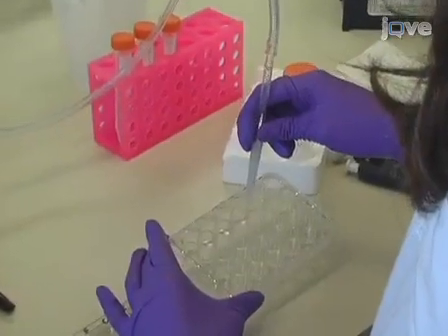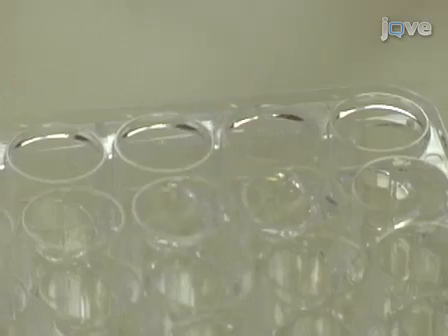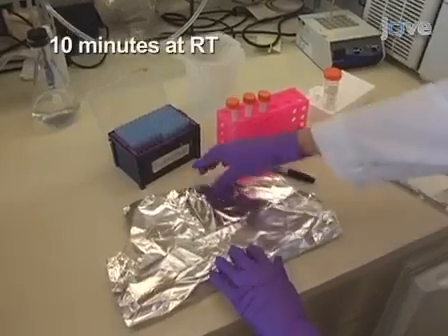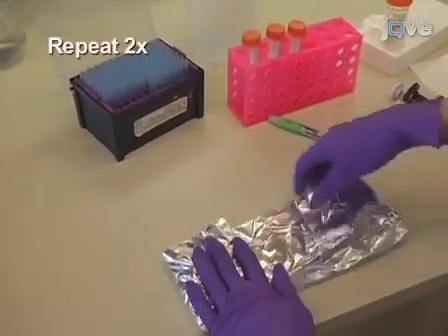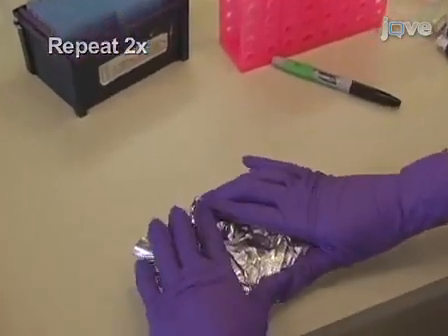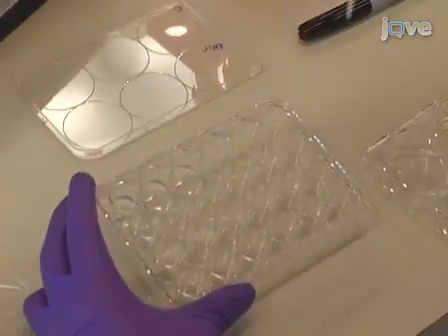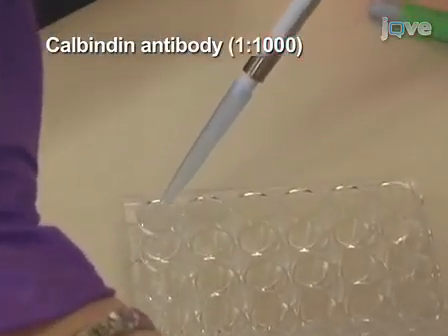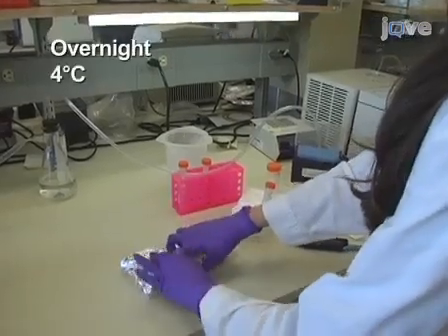When the hour has elapsed, aspirate the TUNEL reagent from the wells and replace with 500 microliters of PBS. Protect the plate from light and incubate at room temperature for 10 minutes to wash. Repeat this process twice. After the last wash, aspirate the PBS and add 250 microliters of a 1 to 1000 dilution of the calbindin antibody in PBS and incubate overnight at 4 degrees Celsius in the dark.